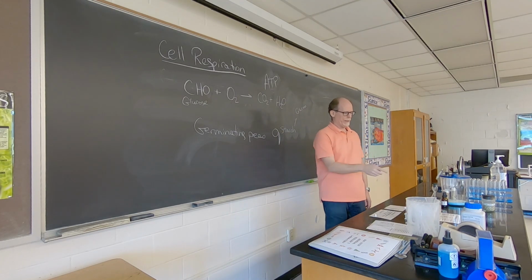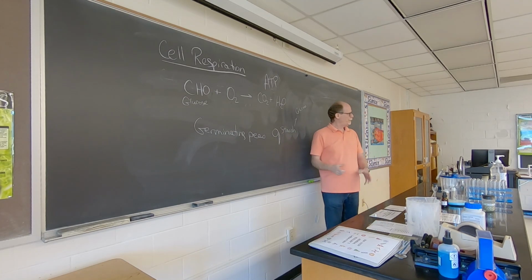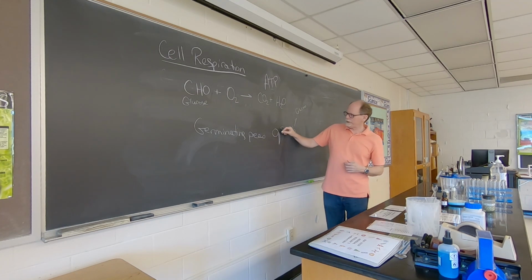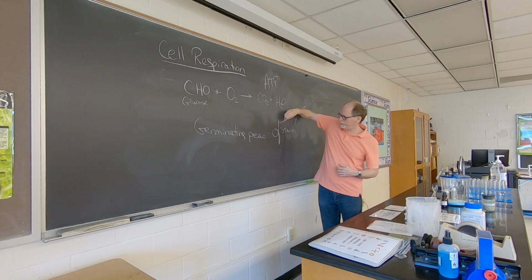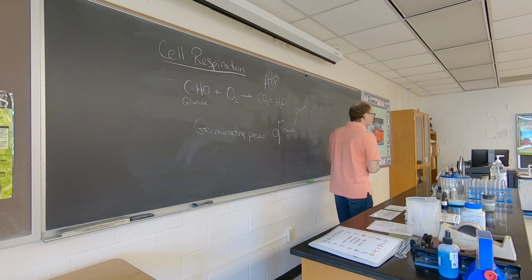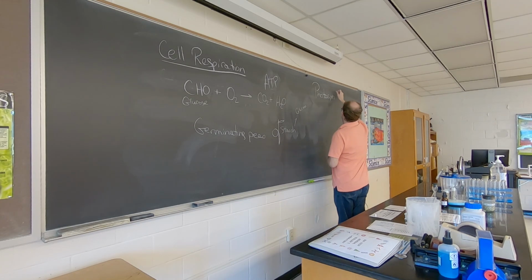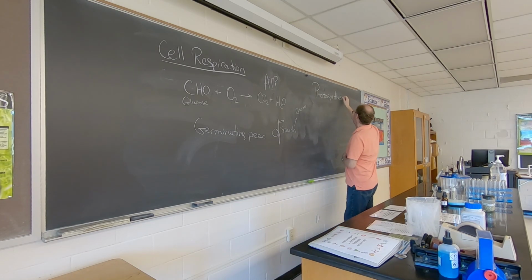So when you look at these germinating peas, there's a little white root. If this was in the ground, it would start to absorb water and nutrients from the ground. And then eventually it would sprout up, and then it would make a leaf. Then it would use photosynthesis, like all plants do.